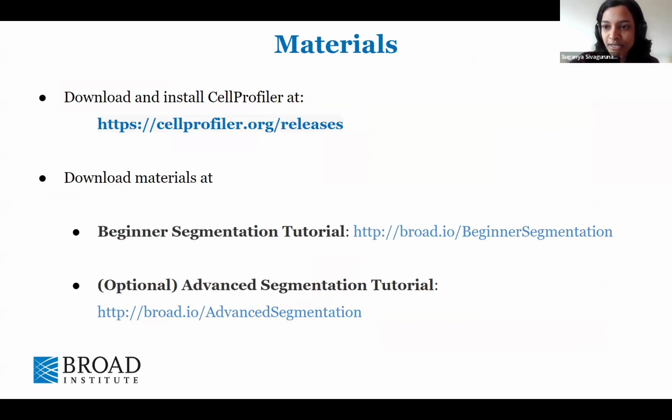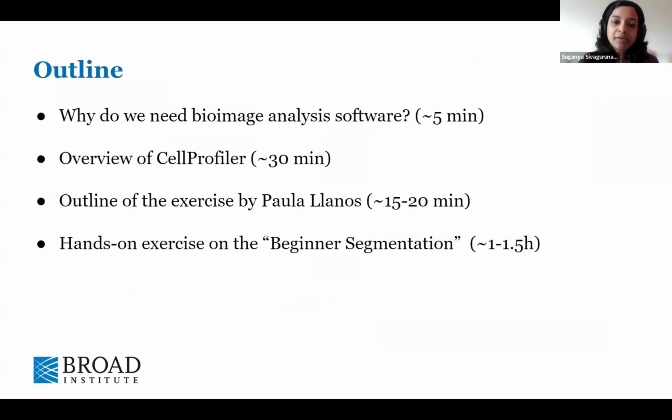Let me give you an outline of how the workshop is organized. We'll begin with discussing why we need bioimage analysis software, and then we'll go over the basics of CellProfiler, its interface, its settings, and the various modules that we can use. Followed by that, an outline of the hands-on workshop will be given by Paula Llanos. And then the fun part is the hands-on exercise where we build a pipeline to do a beginner segmentation.